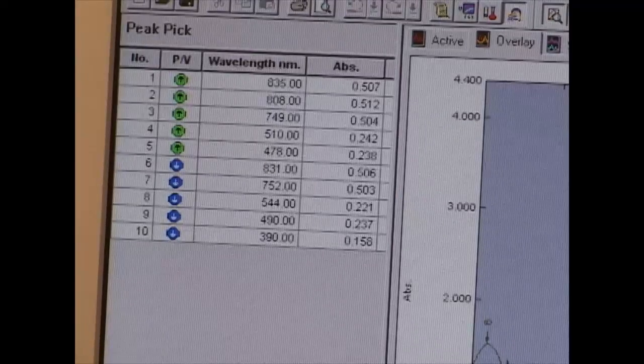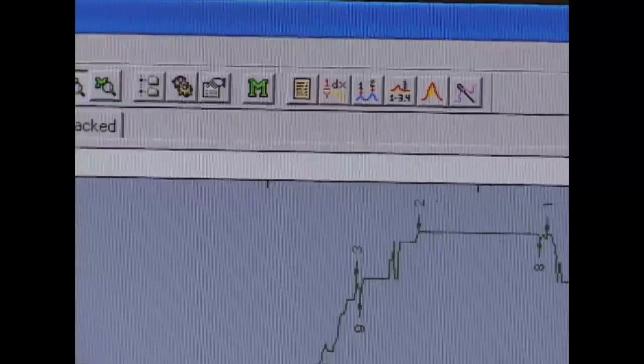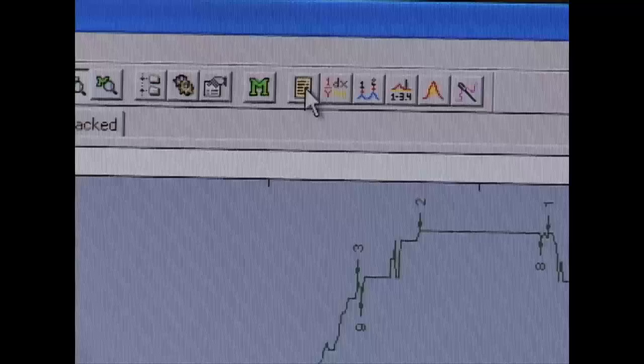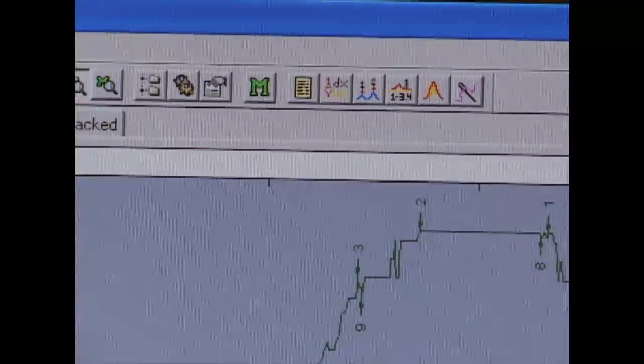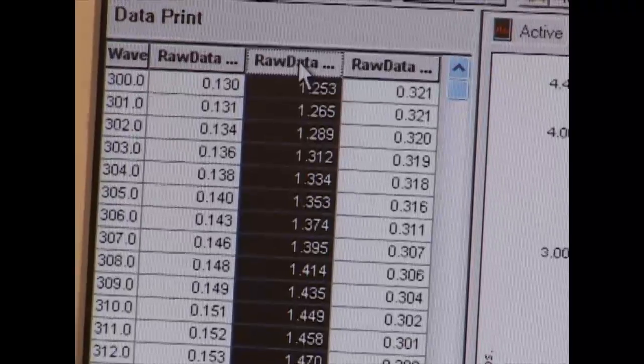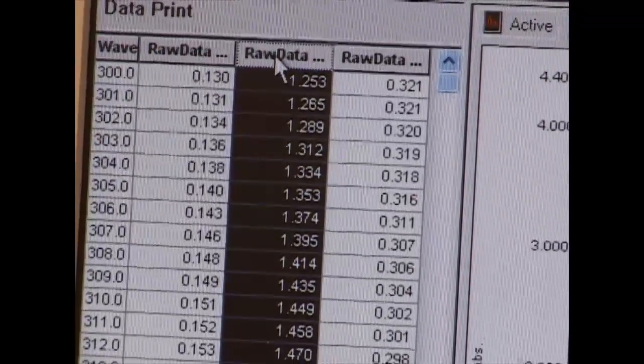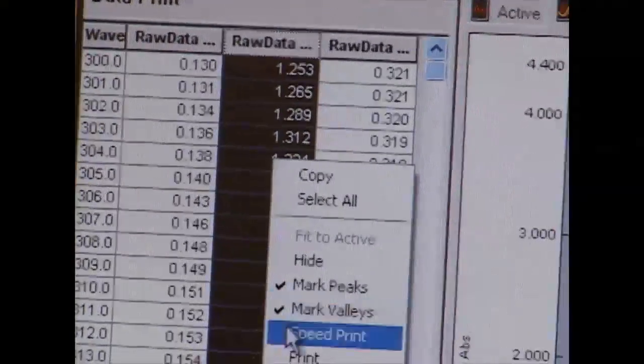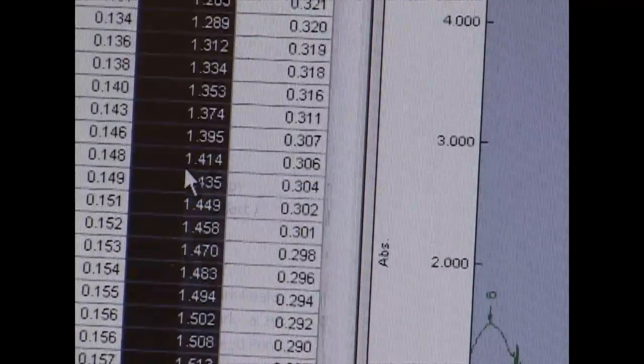If you want to select a different spectrum, you need to press data print and press a different data row. And then you can unselect marked peaks, marked valleys.